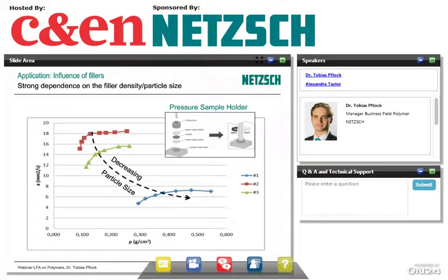We increase the density as we pack the sample more and more. That just increases the density of the powder. And on the left axis, you see the thermal diffusivity A. And as we increase the density of the material, our thermal diffusivity also increases. And it increases most significantly for the larger samples, so for the red sample that you see here.